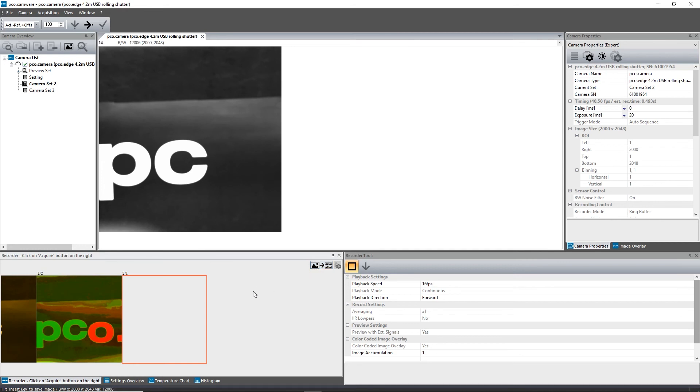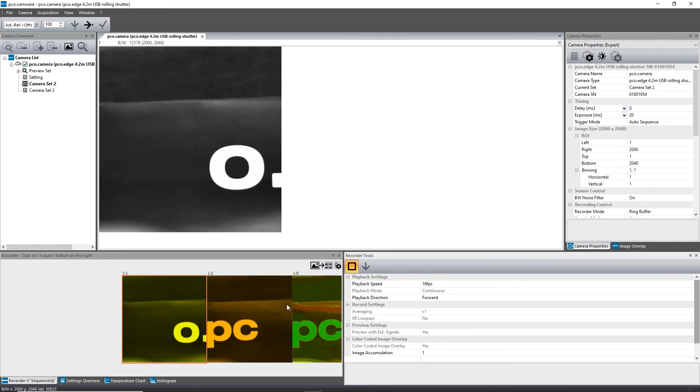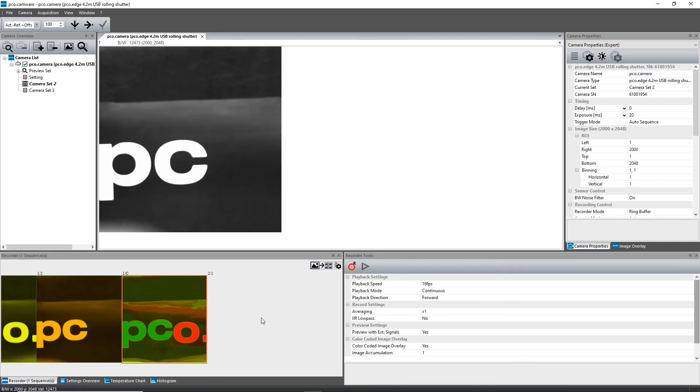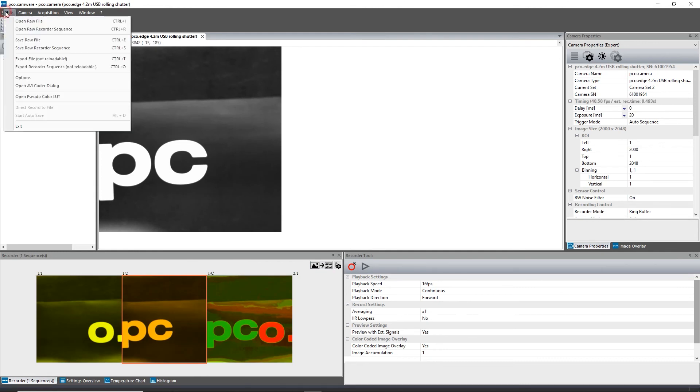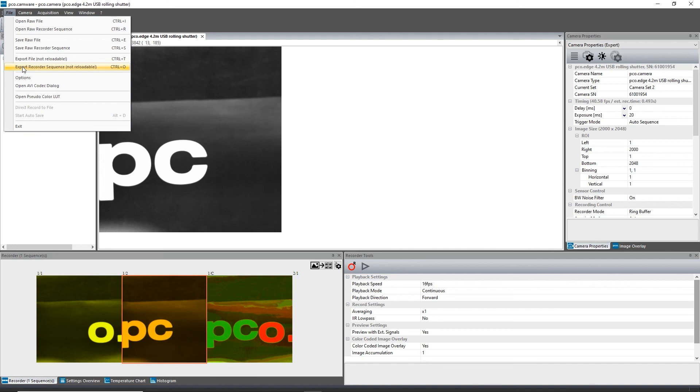If not saved automatically, you can save or export the sequences as usual via file save or export. If you need more information on data handling, please watch our tutorial on this topic.